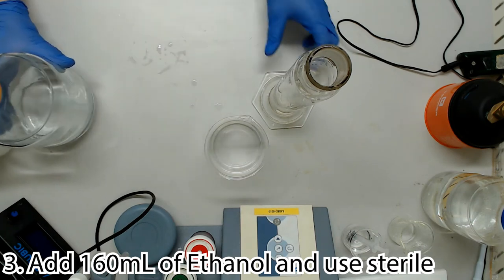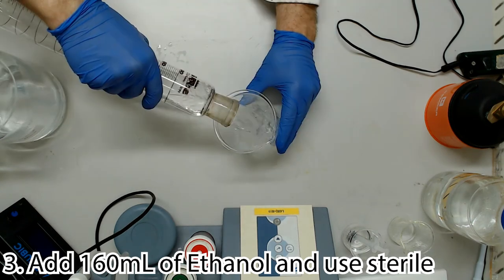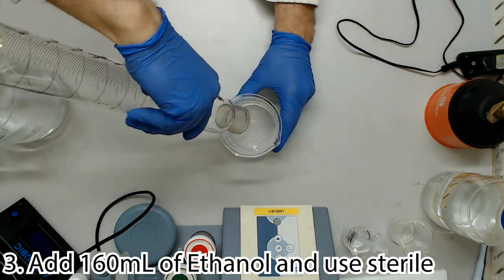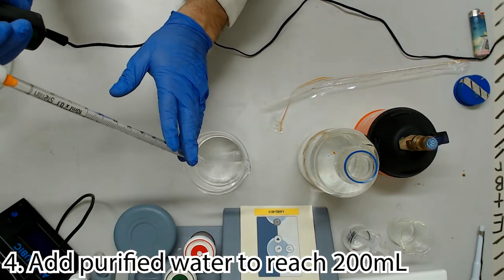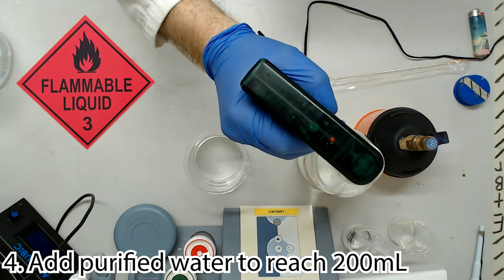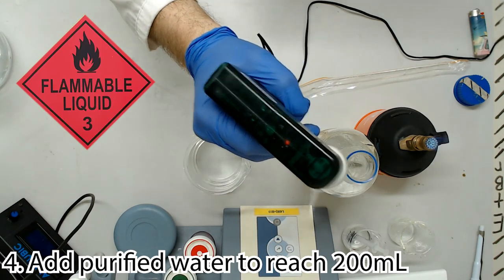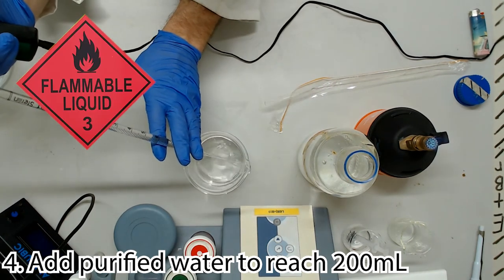As long as you didn't dilute your acid too far, your total volume should now be just under the 200 mL mark. Use sterile purified water to bring the volume up to the 200 mL mark on the beaker. Do not autoclave this buffer, it does not need sterilisation and will catch fire.